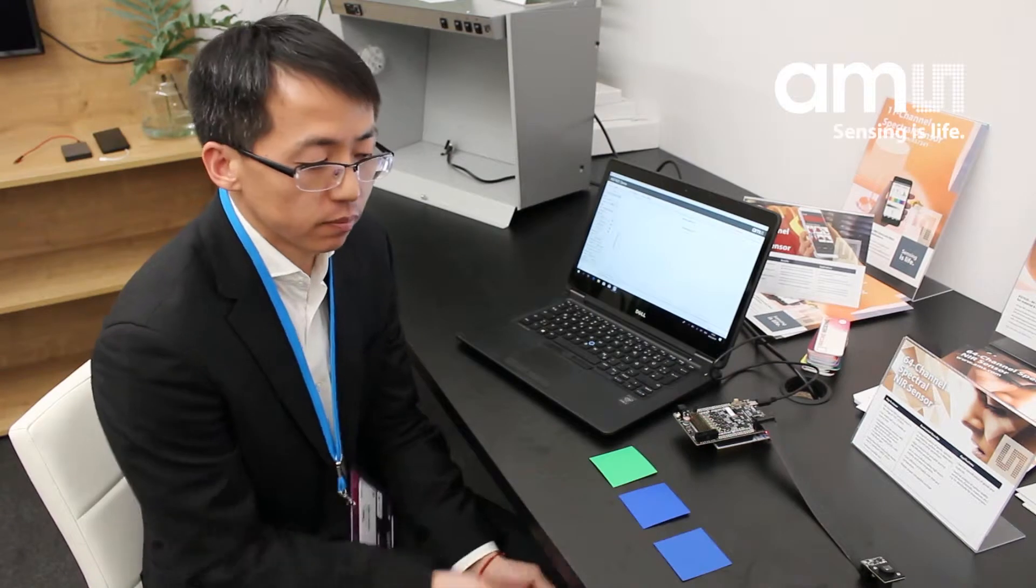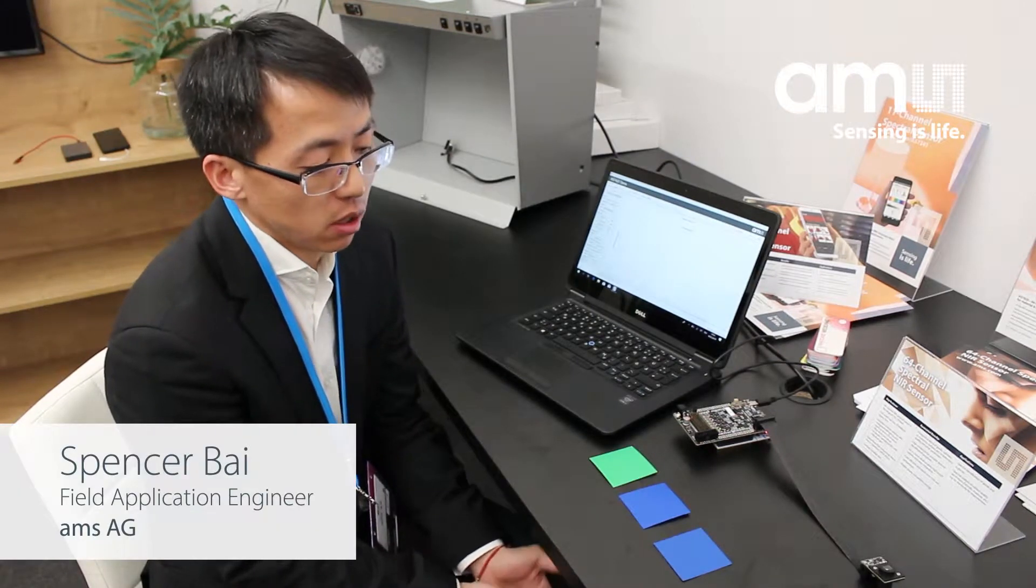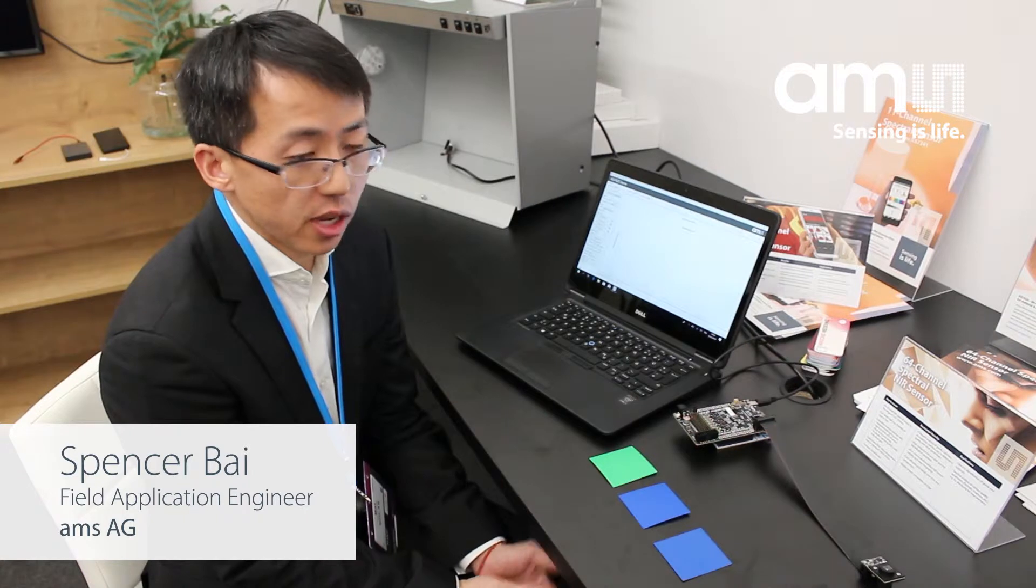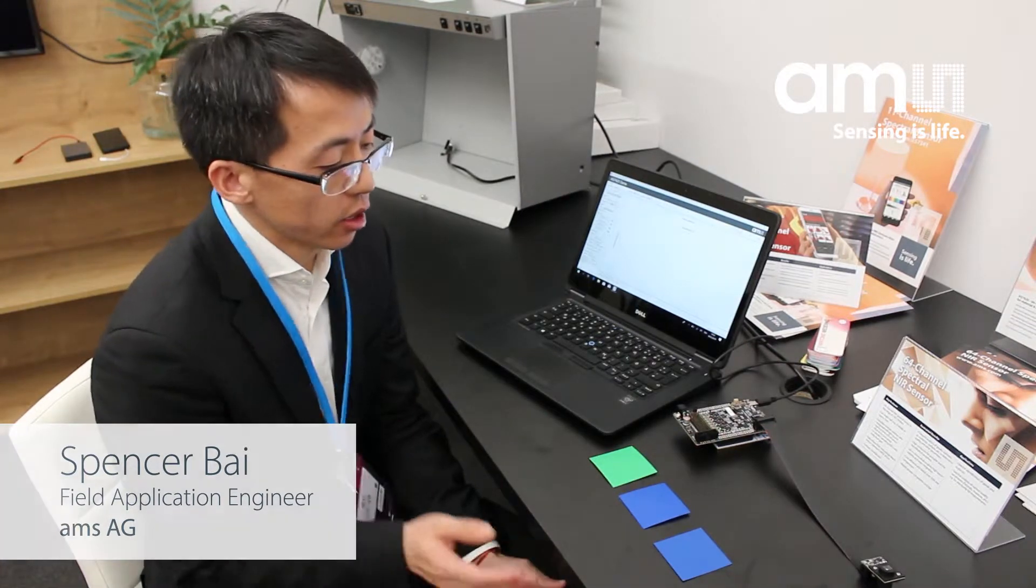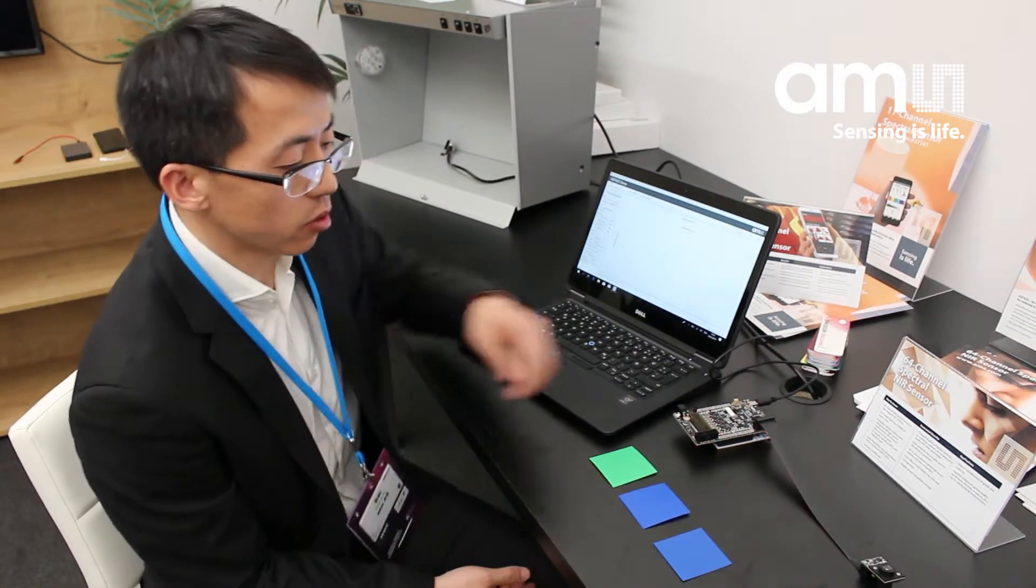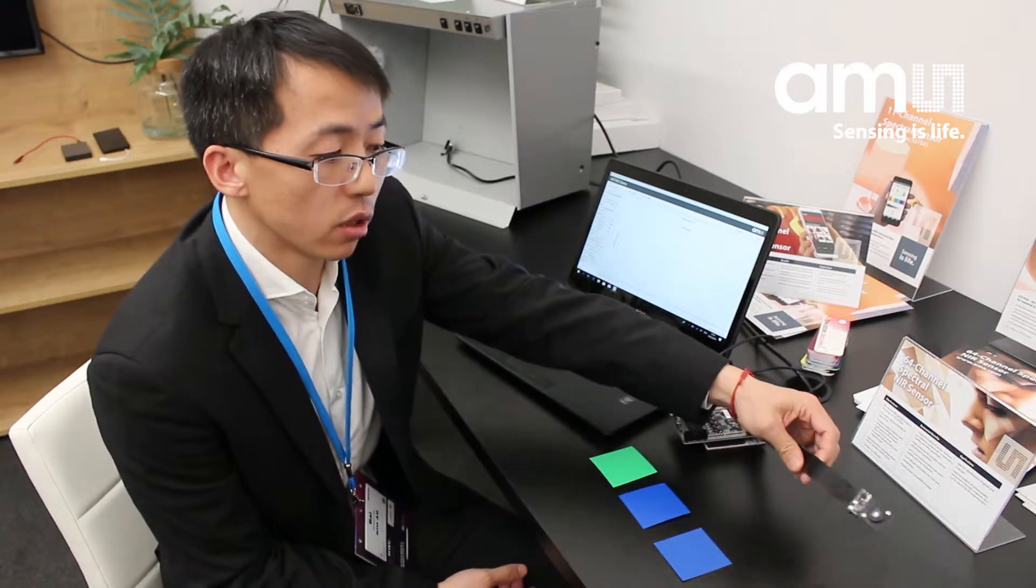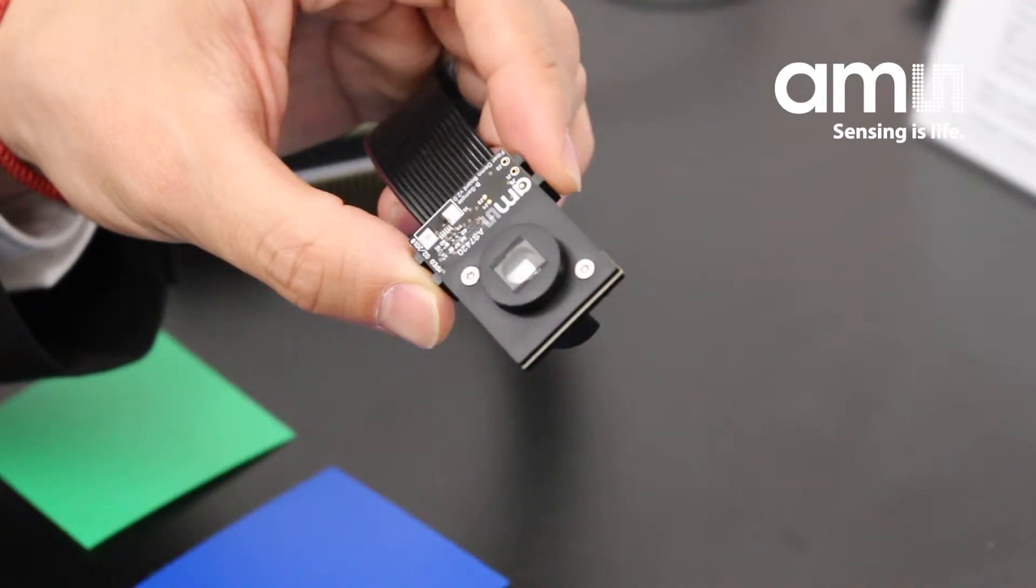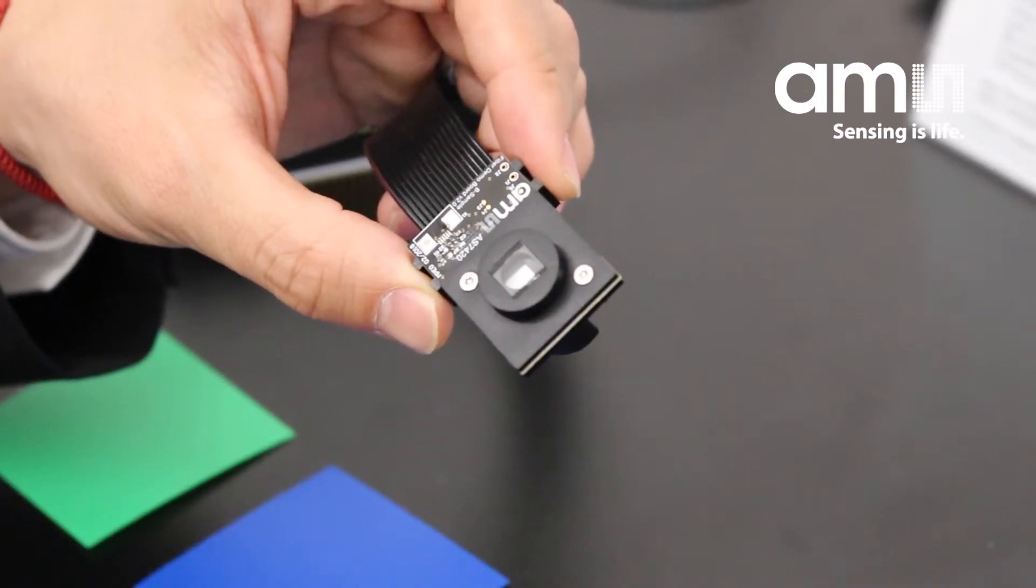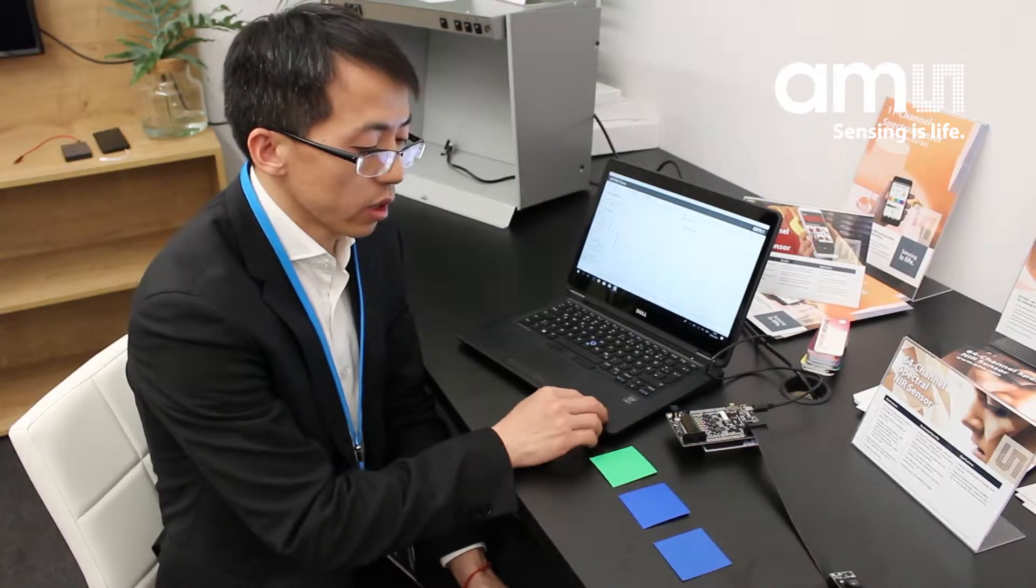Here is another example to show how the spectral sensor can be used in real life. Here is a real demo. This is a six-four channel spectral sensor for the infrared range.